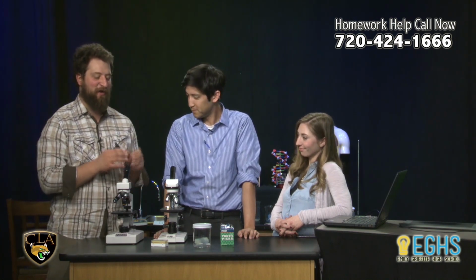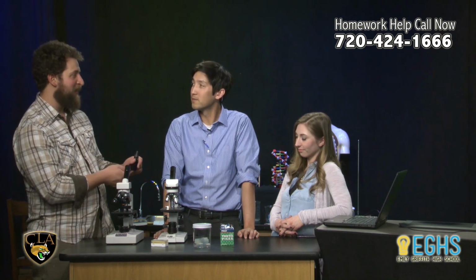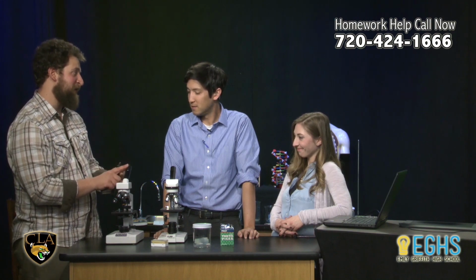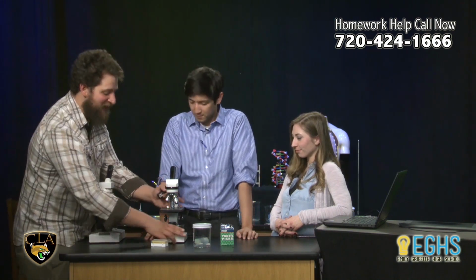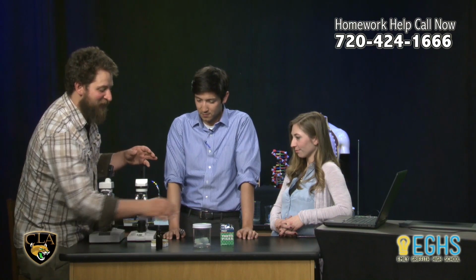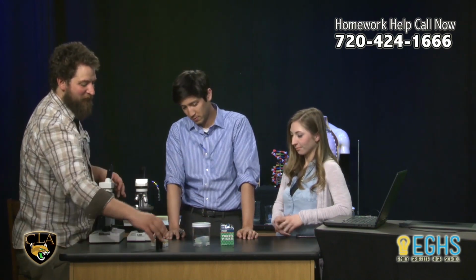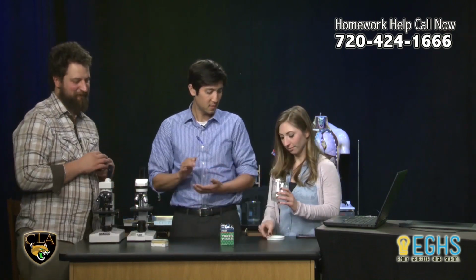Okay, so what we're going to do, guys, is prepare microscope slides, and I'm briefly going to explain how microscopes work. Have you guys check out your own cheek cells, and we're going to try to actually photograph them through the microscope lens using your smartphones. This is something I've actually seen videos of lab scientists doing, just to get a quick shot of whatever they're looking at. So the first thing I need you guys to do is each take a glass slide for me. You can just drop that, Nate. I'll put it in when we get a second.